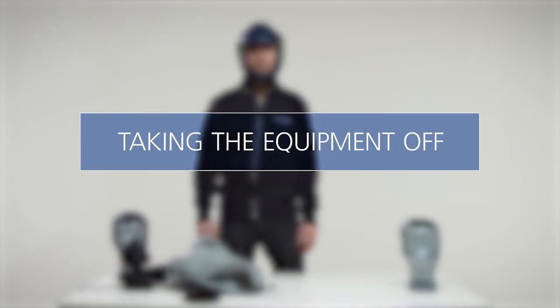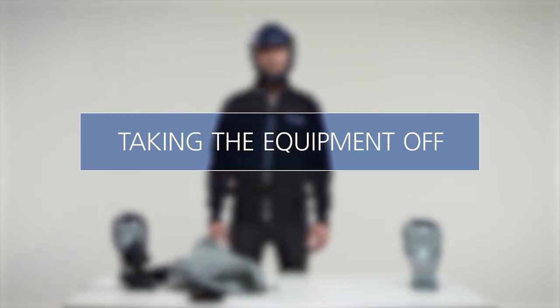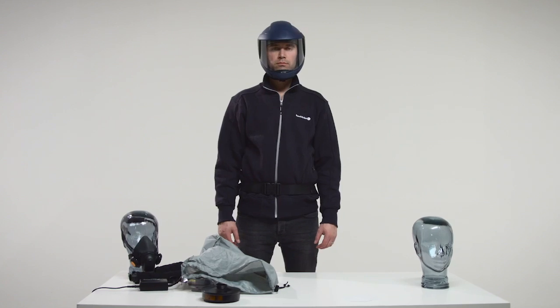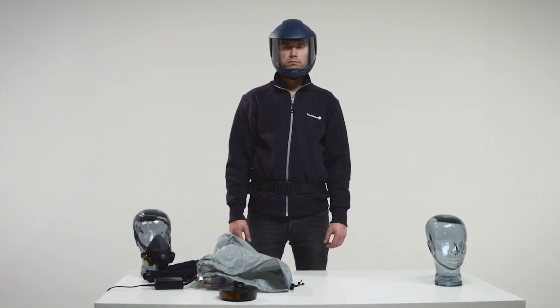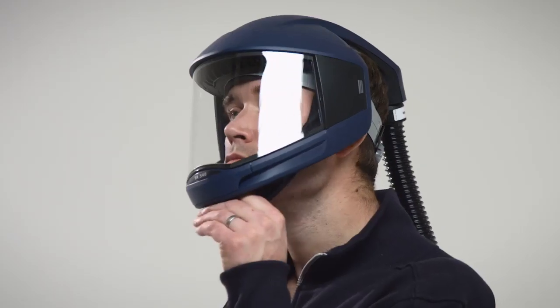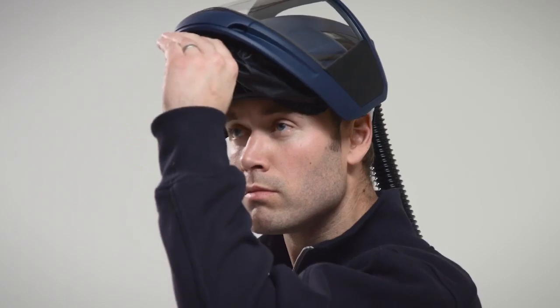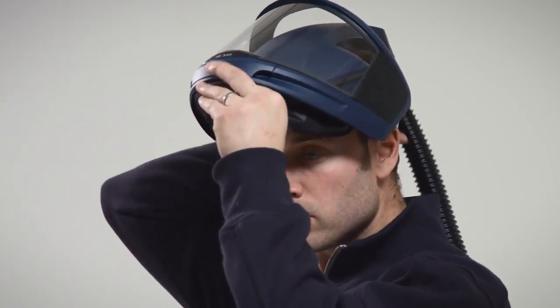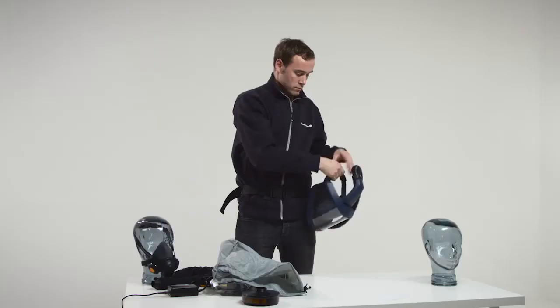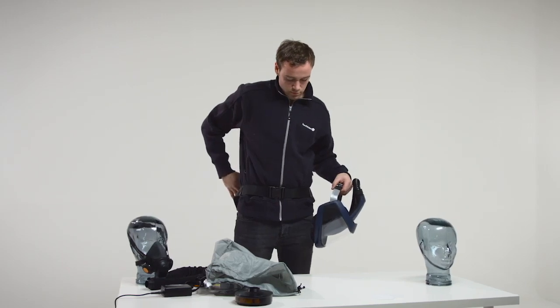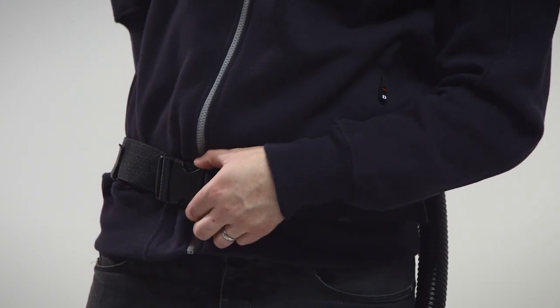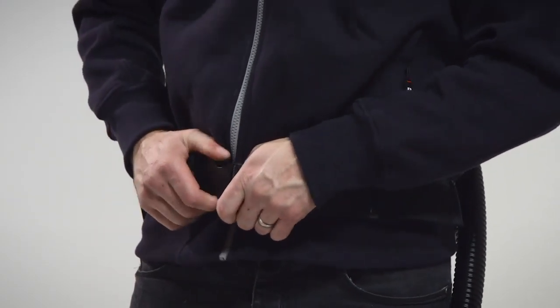Taking the equipment off. Leave the polluted area before taking the equipment off. Take off the head top. Switch off the fan unit. Release the belt and remove the fan unit.